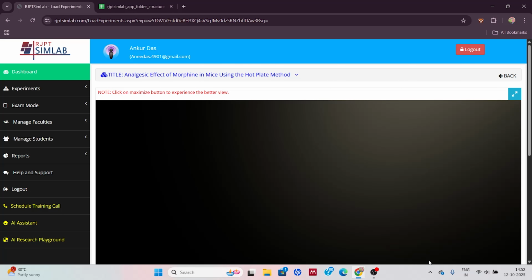So now we have come to the end of this video. I hope that you have learned a lot about the analgesic effect of morphine in mice by using the hot plate method.